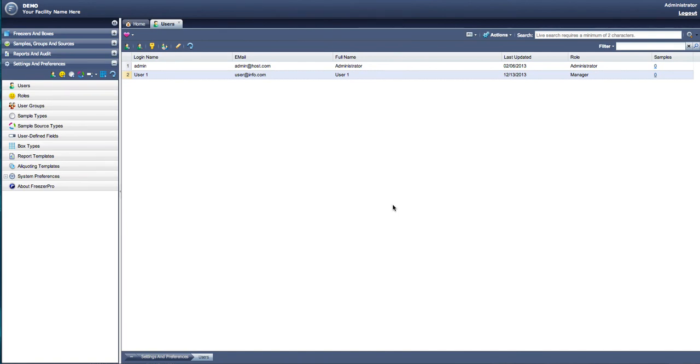This concludes the general configuration managing users video tutorial. Up next, we will discuss managing roles.